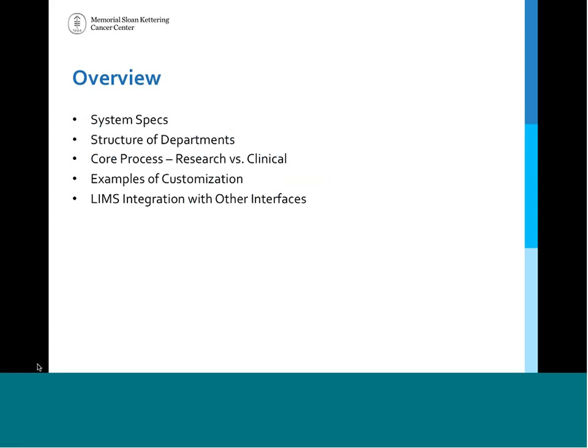I'm going to talk briefly on the structure of the 2 different departments that utilize LIMS systems, and then I'm going to delve a little bit deeper into the 2 different core processes and the differences between the research and the clinical system. The bulk of my time is going to be spent discussing how we have successfully customized Sapio's Exemplar LIMS system to fit our specific research needs.